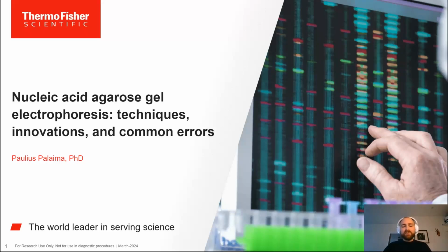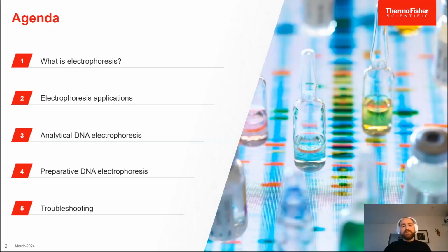We will have several key topics covered during this webinar, starting with the basics and description of electrophoresis and its history, and proceeding to best practices and common mistakes, as well as troubleshooting and how to avoid those mistakes.